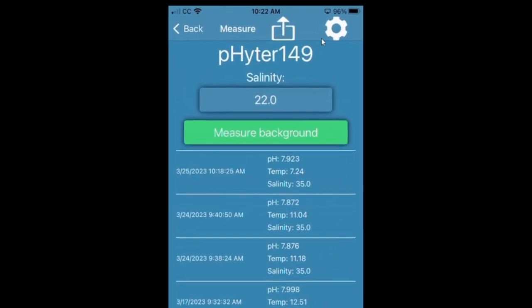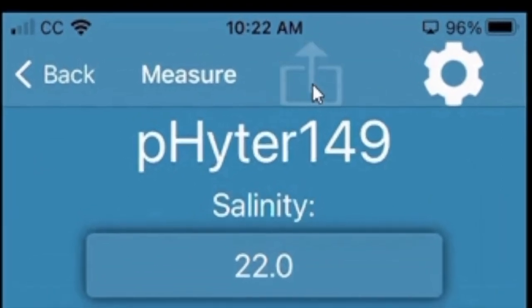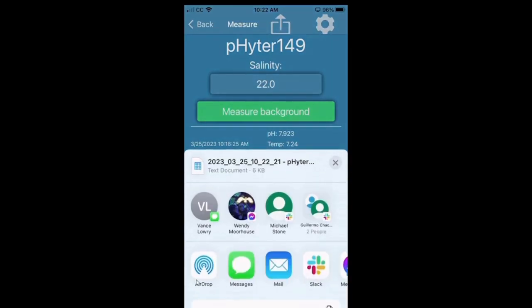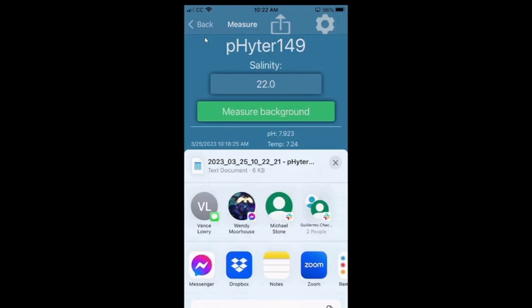When you're ready to upload the data to some other source, you hit the upload button. And then you can either send to mail or send to Dropbox.